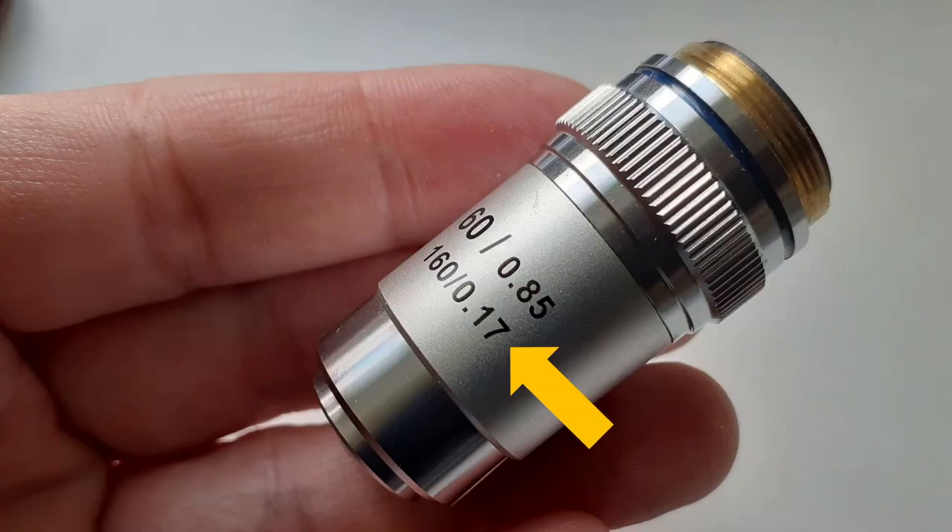As a matter of fact, the cover glass thickness is so important that there's even a number printed on many microscope objectives. Usually the number is 0.17, and this refers to the optimal cover glass thickness — so 0.17 millimeters.